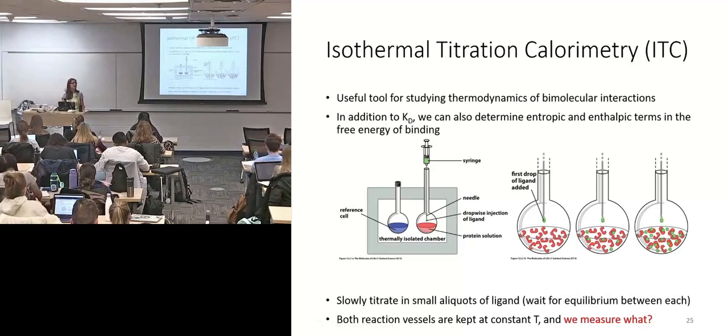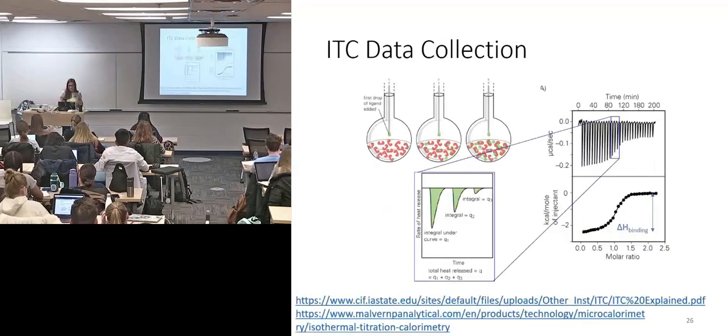We're forming some new interactions between our ligand and our protein, so we expect heat release, releasing heat, I'm sorry. Delta H is negative. It's a release of heat.